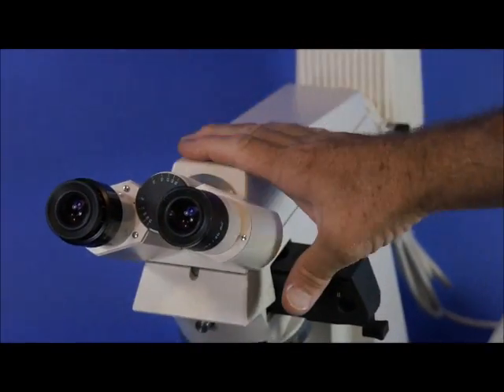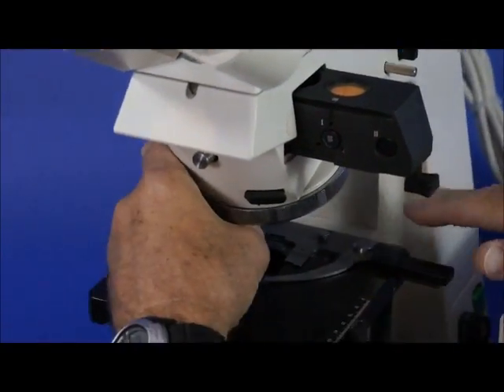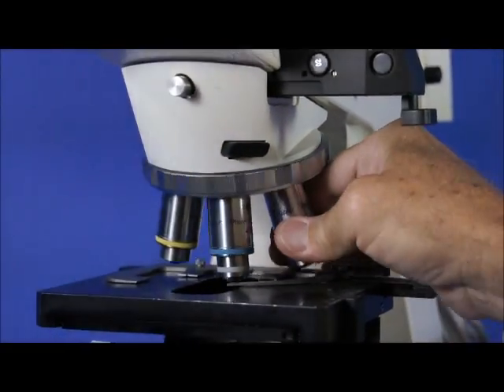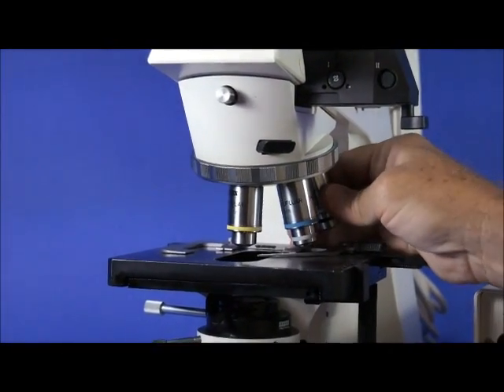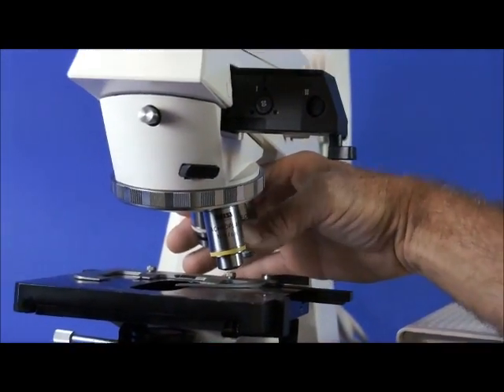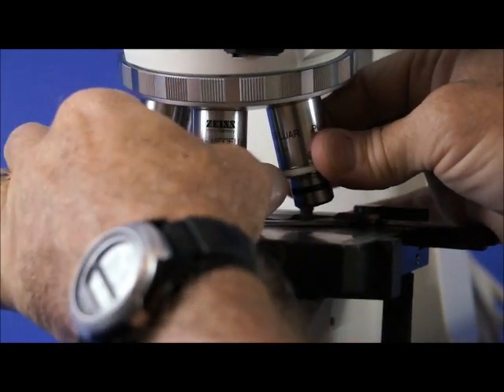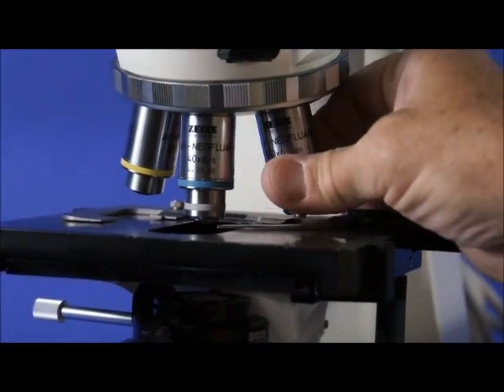Okay, moving right on down, we've got the nose piece, which is a six-place nose piece. Most nose pieces are five-place. This is a six-place. And it's equipped with a couple of very nice lenses, and I'm going to explain those in a second. You've got a 10X Acroplan, which is a plan achromat. And next you have Plan-Neofluars, which are the state-of-the-art lenses for Zeiss.